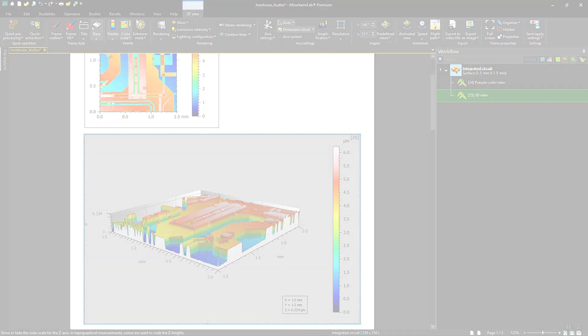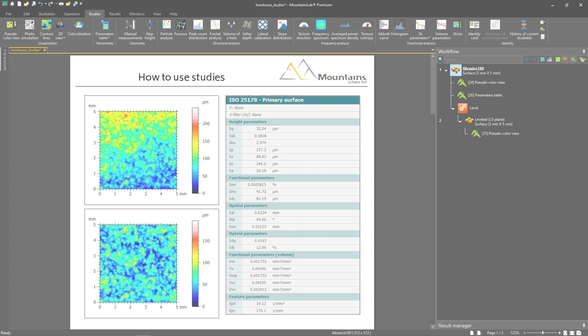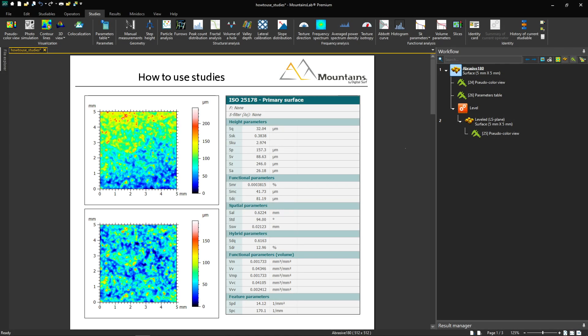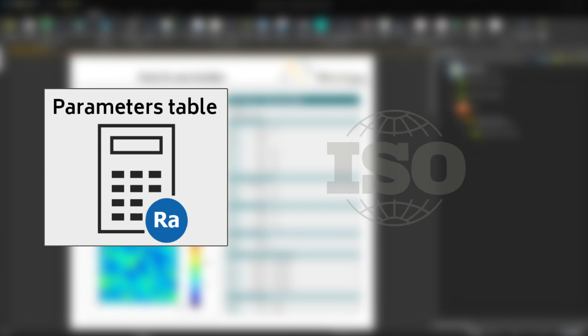Here's another example. One of the most used studies in MOUNTAINS is the parameters table, which lets you calculate and show parameters for a given studyable in accordance with the latest ISO and national standards.